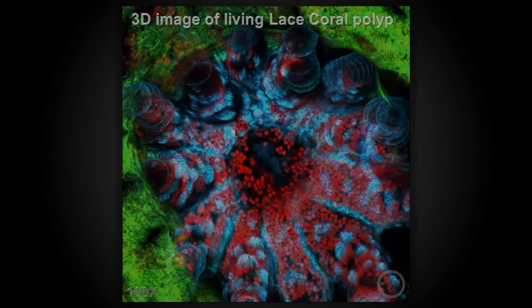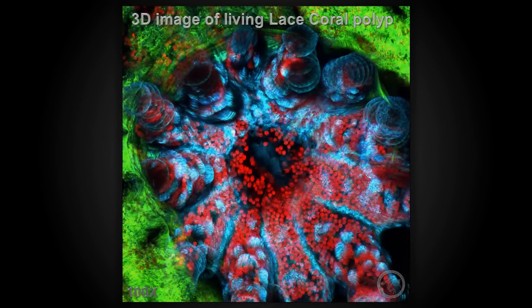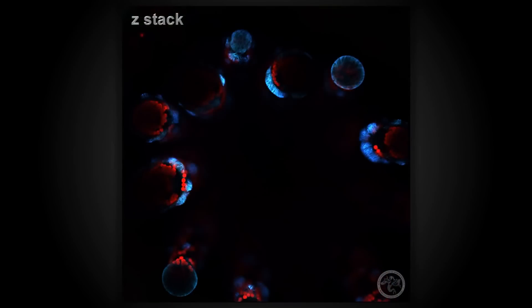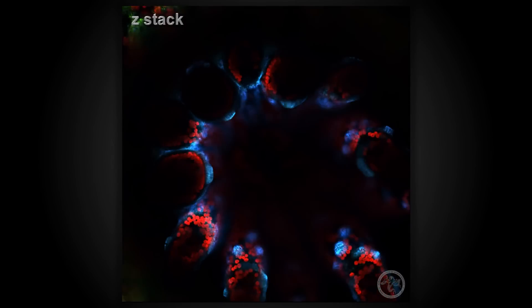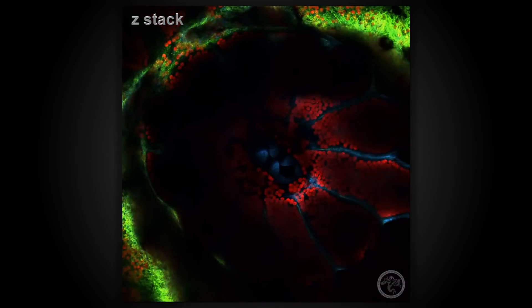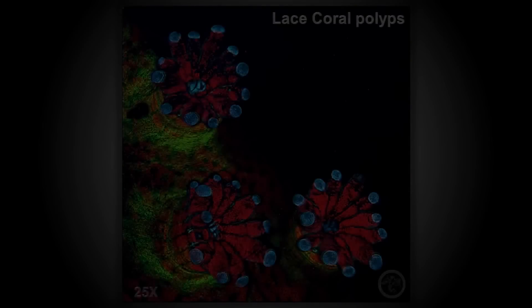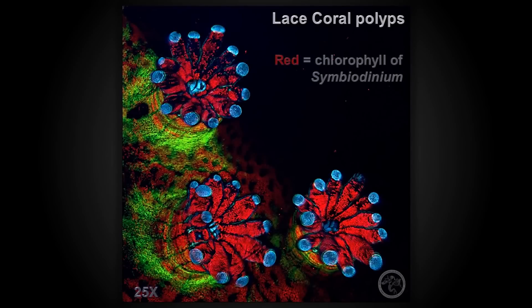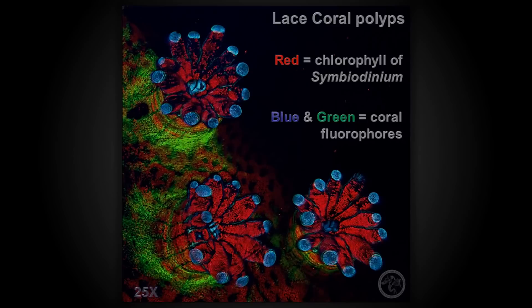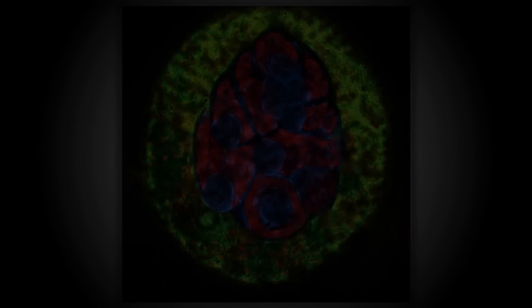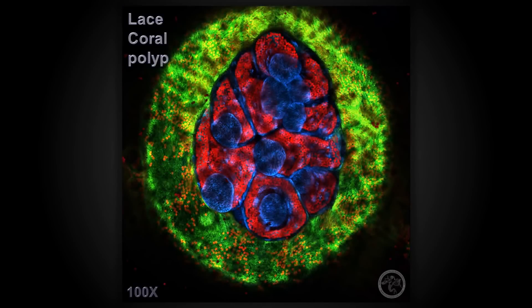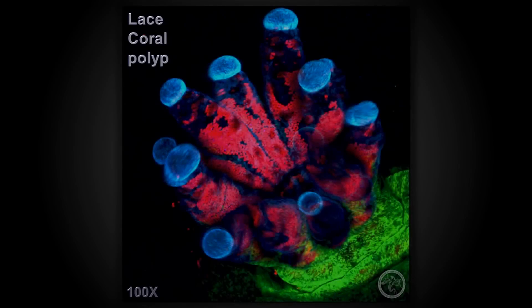Confocal microscopy can give high-resolution images by eliminating light from outside of the focal plane. Layers of data from different focal planes, known as z-stacks, can be collected and reassembled into three-dimensional images. Confocal images can clearly show the distribution of different fluorophores. Individual red dots of symbiodinium can be seen in the tentacles and throughout the coenosarc. The fluorescent protein, represented by the blue color in this coral, seems to be closely associated with biological structures containing nematocysts, or stinging cells.